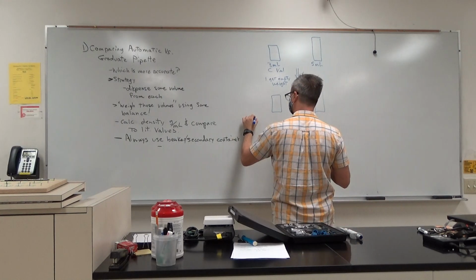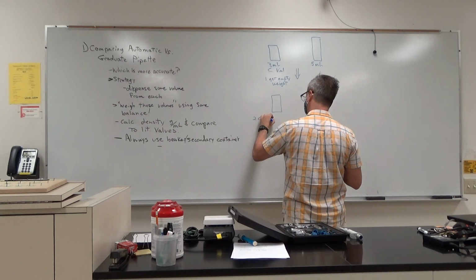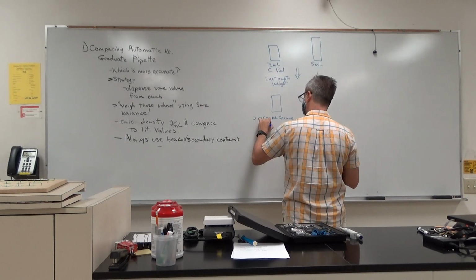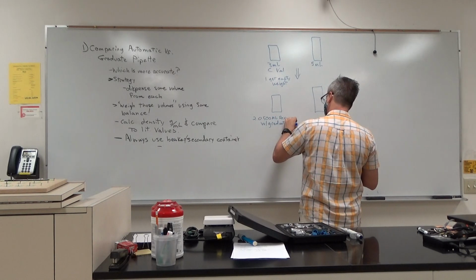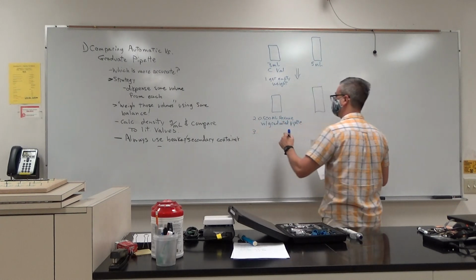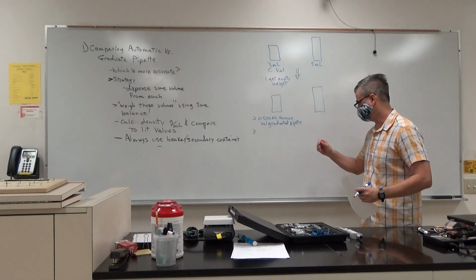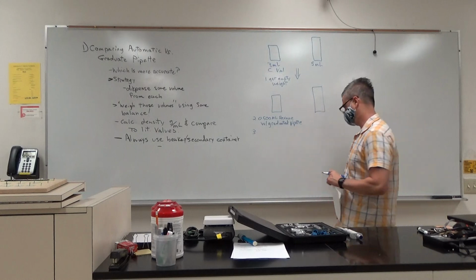Step 2: 0.500 mLs of hexane with the graduated pipette. So use the graduated pipette and put 0.5 mLs into the 3 ml conical vial. It wouldn't actually matter if you used the graduated with the 5 ml and the auto with the 3 ml, but I just chose one way to describe it to you.